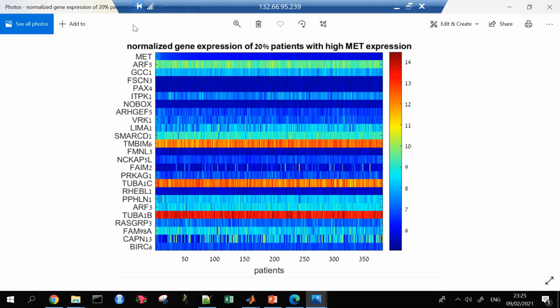The title here is normalized, but it isn't, and I didn't change this title because seriously, this graph isn't used. Pretty sure Elon already forgot about what he asked me to do. He called it normalized, but it isn't.